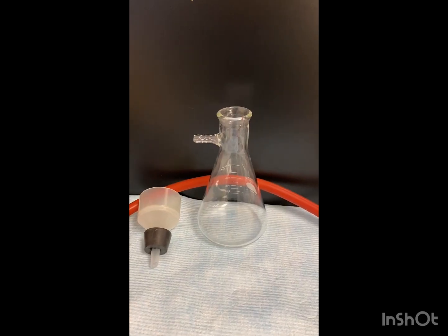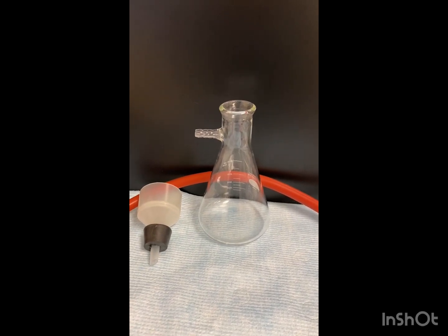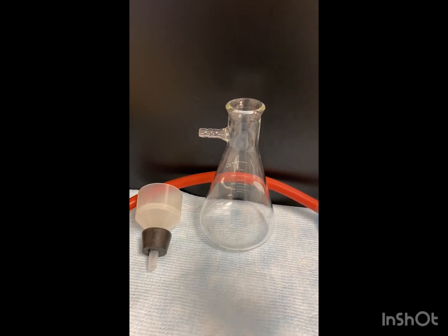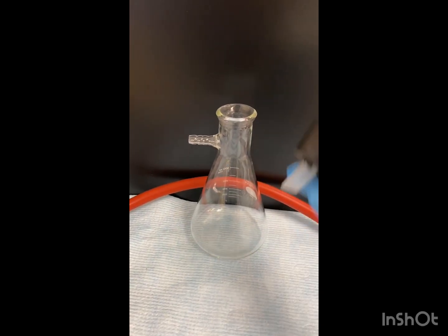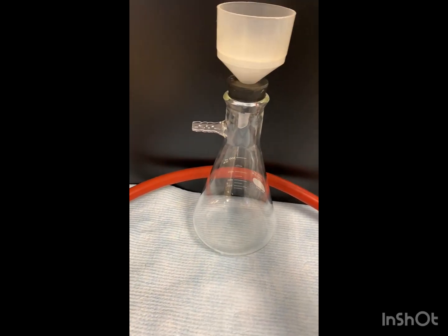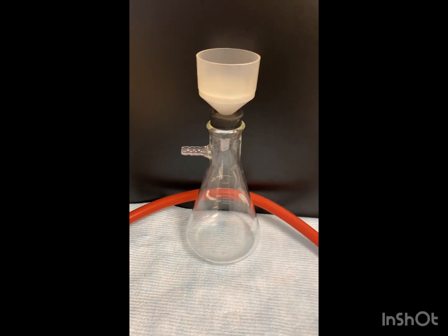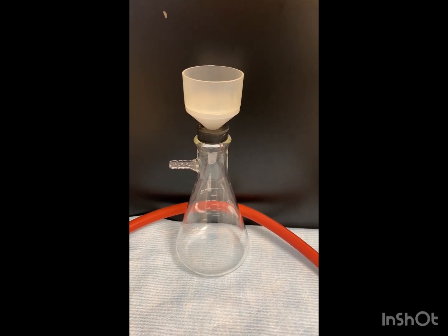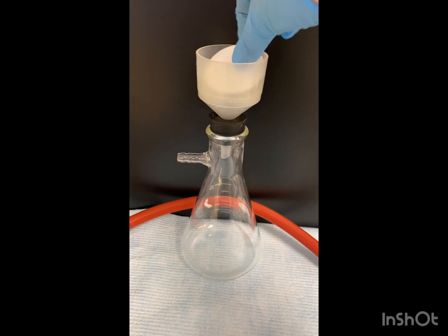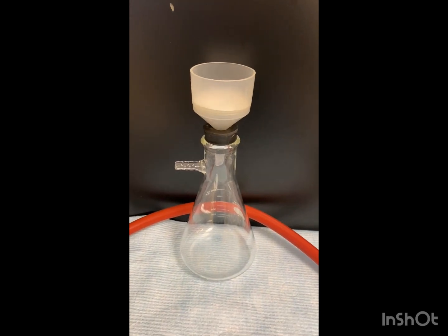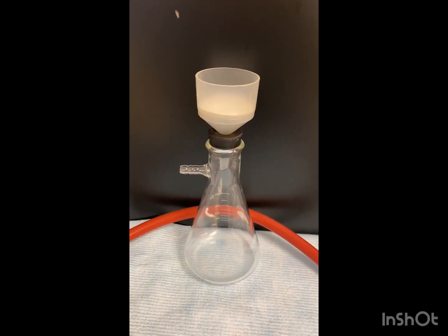While we are refluxing, we can go ahead and set up our vacuum filtration. So you need a filter flask, a Buchner funnel, an adapter, and a red vacuum hose, and you just hook it up to the vacuum nozzle, and we're ready. And of course, our filter paper - make sure you use the correct size, and then you're ready for your vacuum filtration.